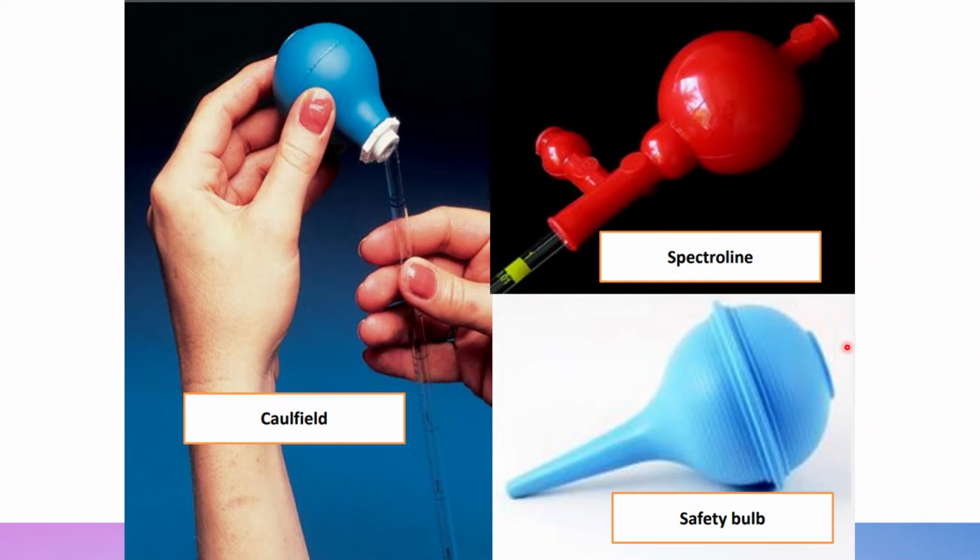transfer fluids. We don't do mouth pipetting anymore, class. Mouth pipetting is so obsolete, so please do not do it in the laboratory. We make use of these different suction bulbs.